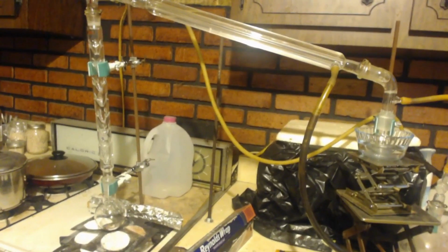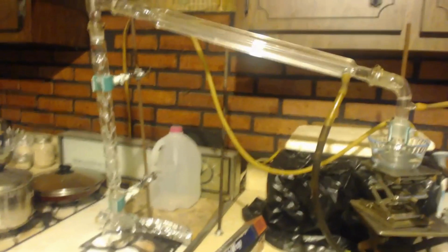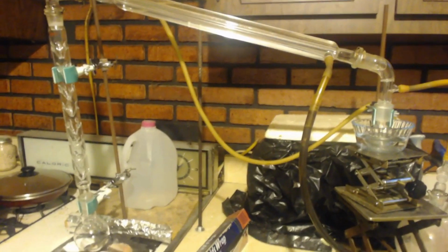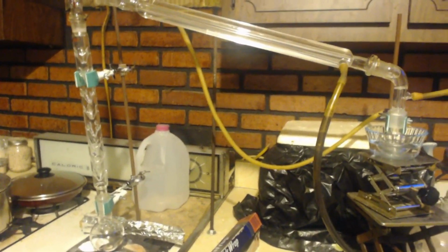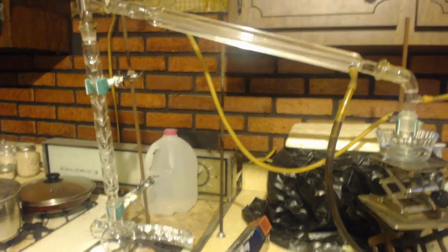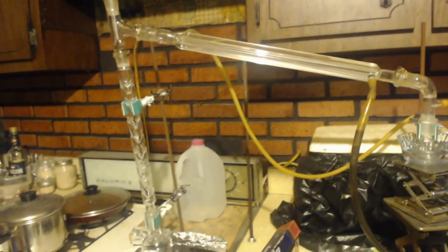So I had a leak and my fume hood wasn't working. I actually, after I got done, I ripped out the fans, and I'm going to have to put them in the right way so that there's no leaks in that. But anyways, I did it extra fast instead of doing it in 4 to 6 hours, which is what I was going to do it in. I did it in like 15 to 20 minutes. So obviously I'm not going to get a good yield.